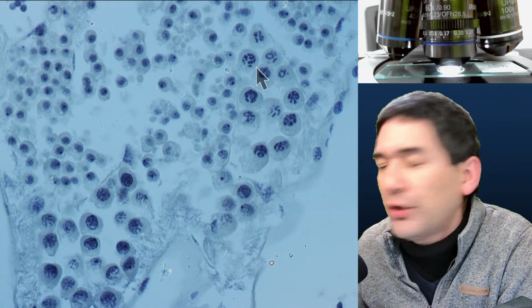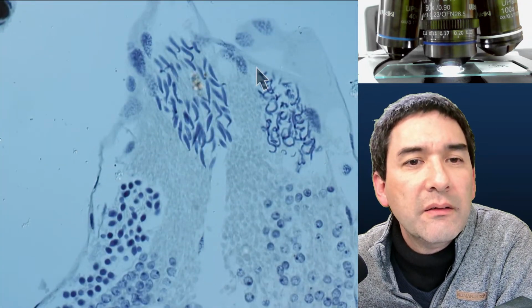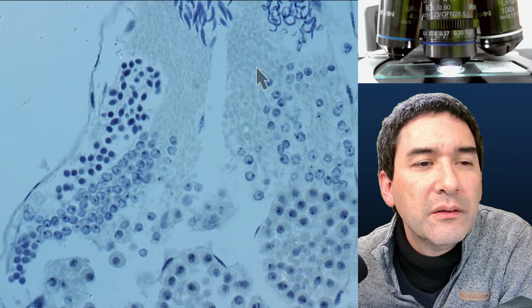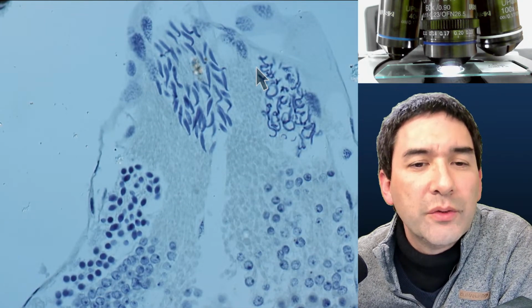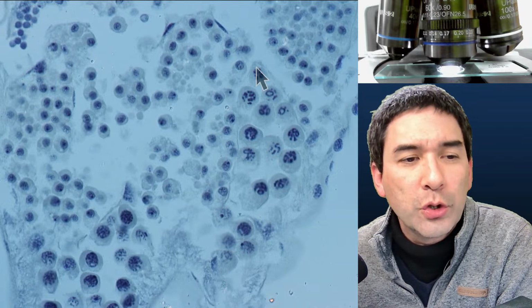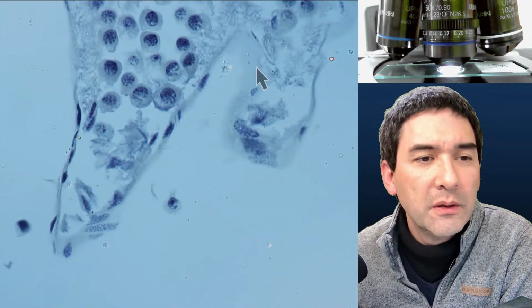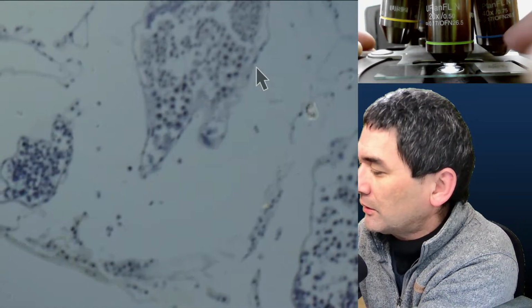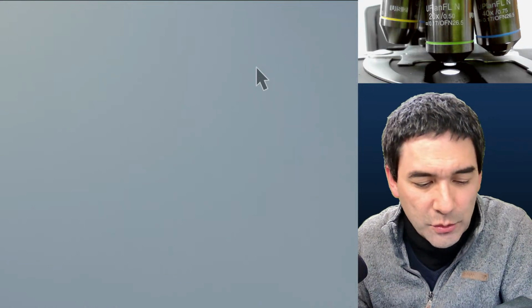Because of course, as the gametes are produced, the cells divide. Here again it looks quite different. I wonder if these are already the finished gametes. Well, in any case, that's more a histological cross section. But I think we're just gonna go back to the whole mounts that we had before. Okay, again. So let's put this away. It's more a histological sample.